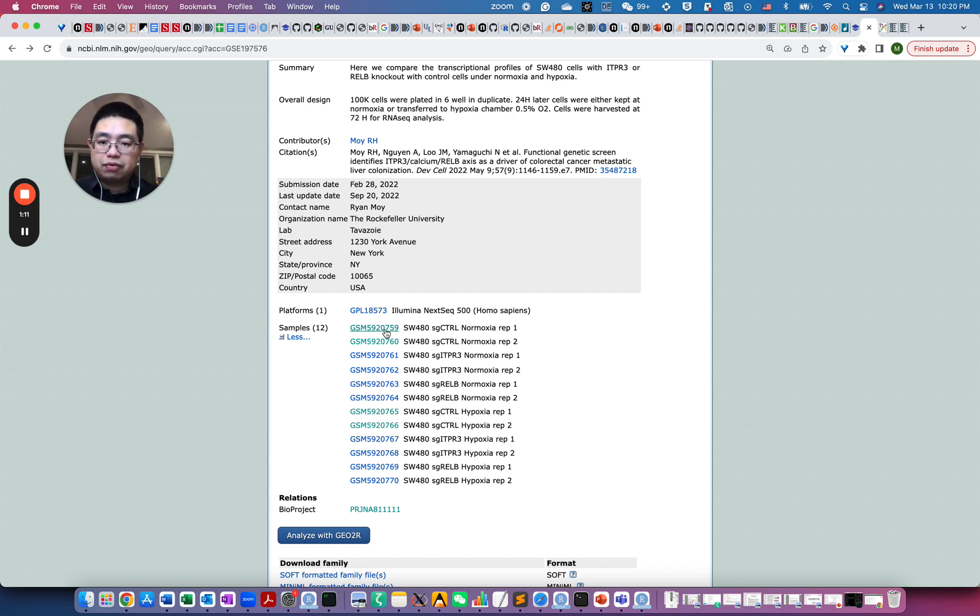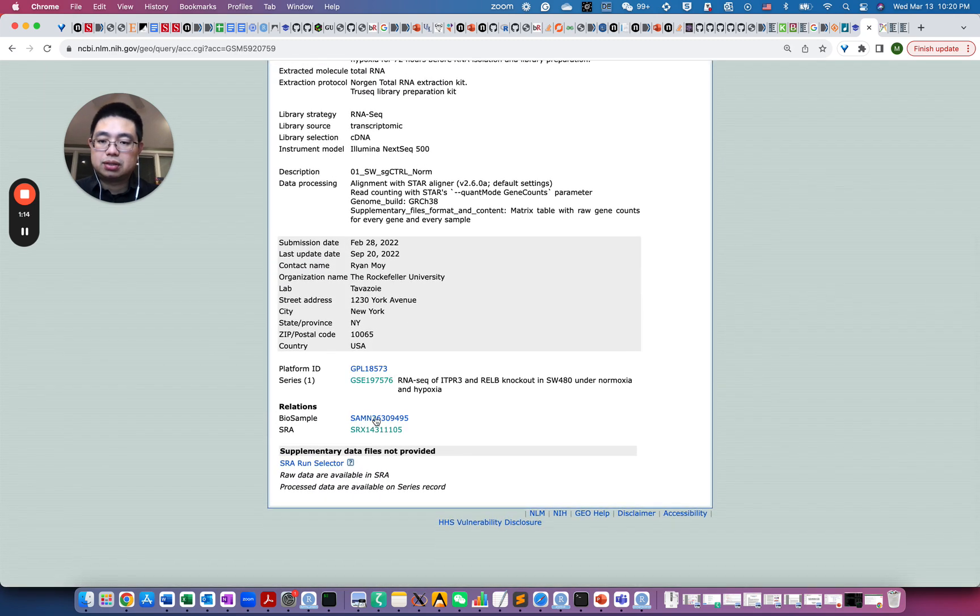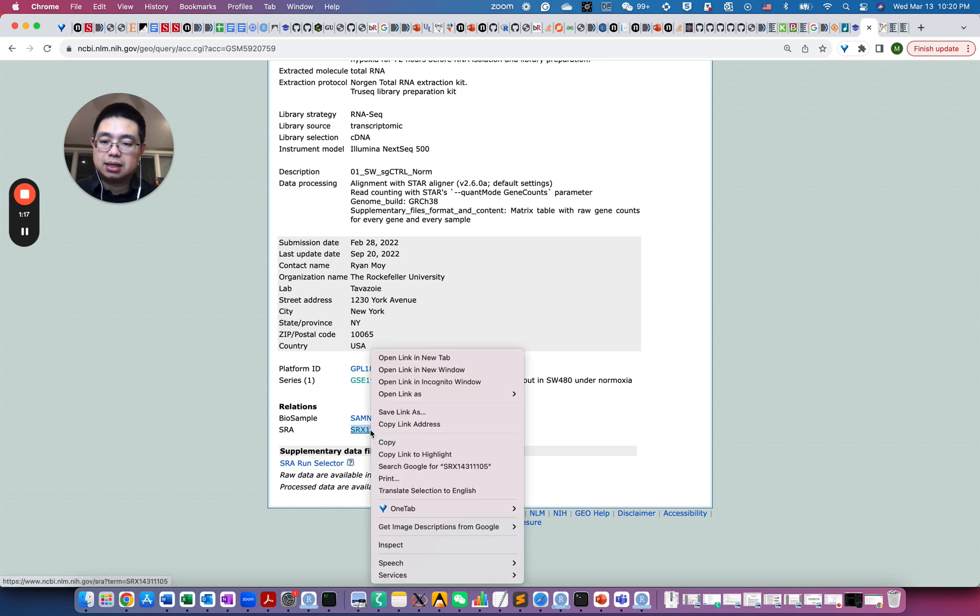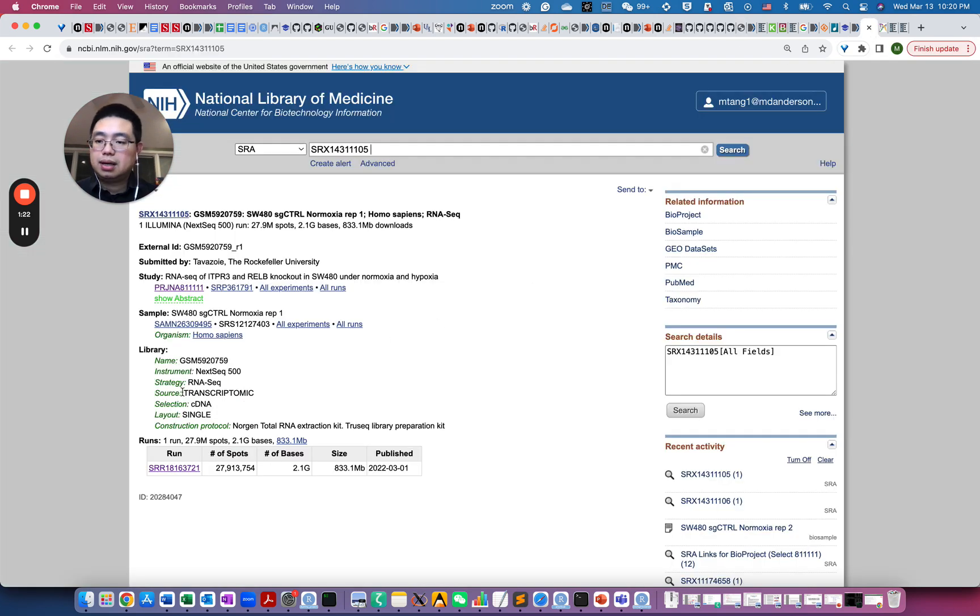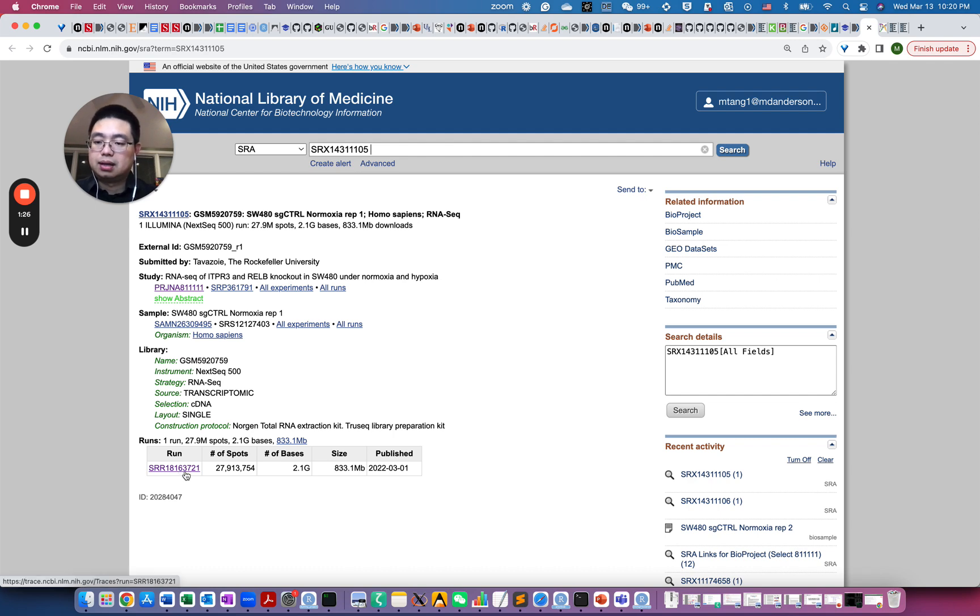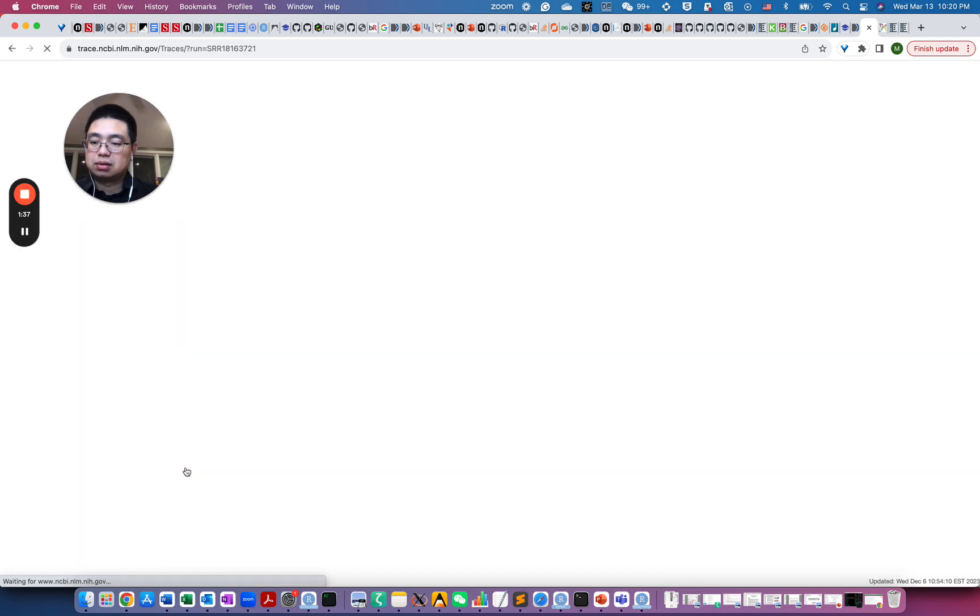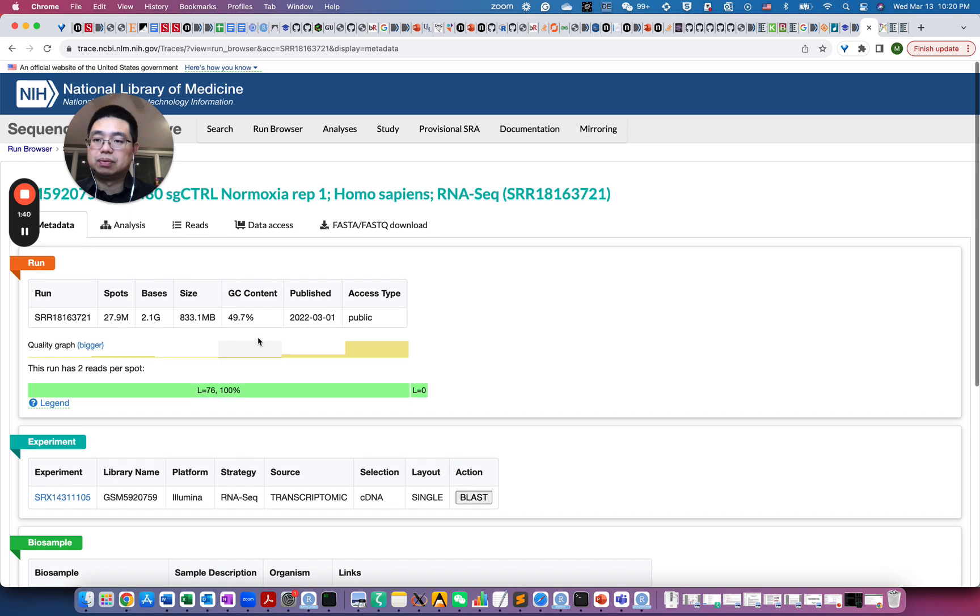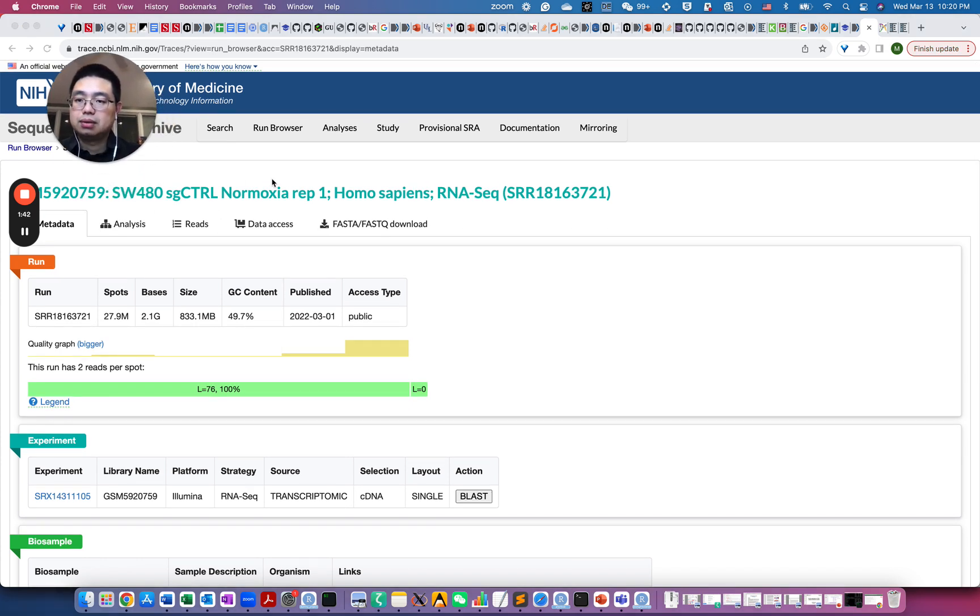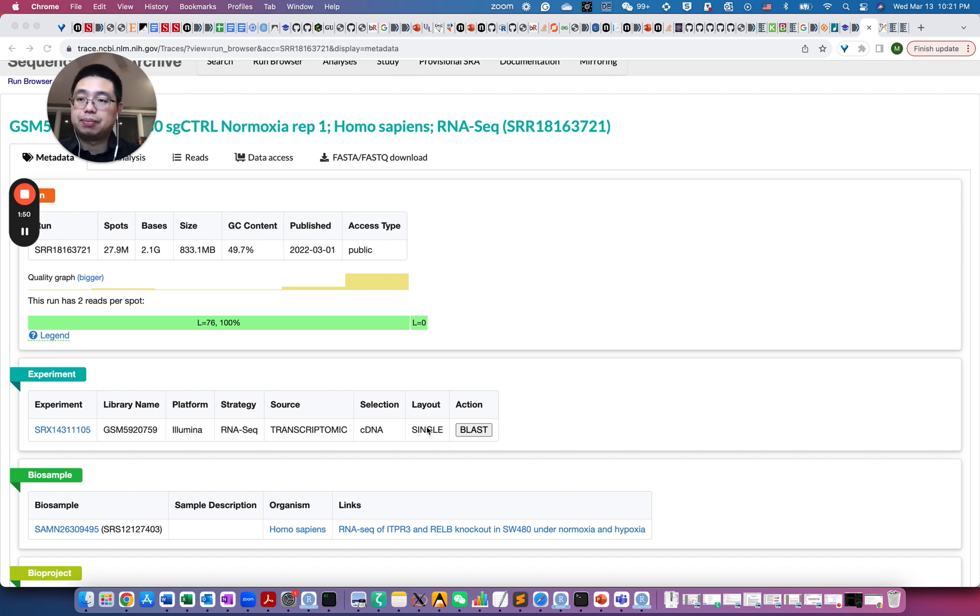So if you click this, you will see this SRA ID here. So if you go here, you see those are the SRR files. Those are not FASTQ files, those are SRR format. And then you need to actually convert those SRR files into FASTQ files. So if you click this, you'll have the information. This control sgRNA under normoxia condition, and I believe it's also single end instead of paired end.